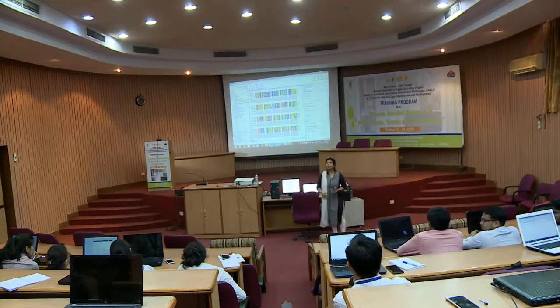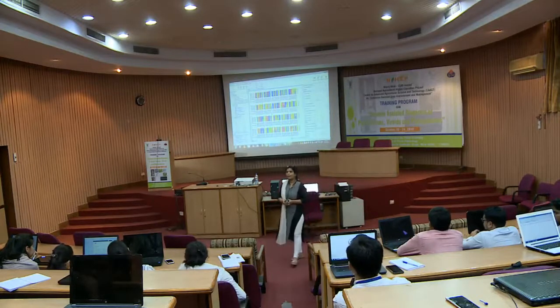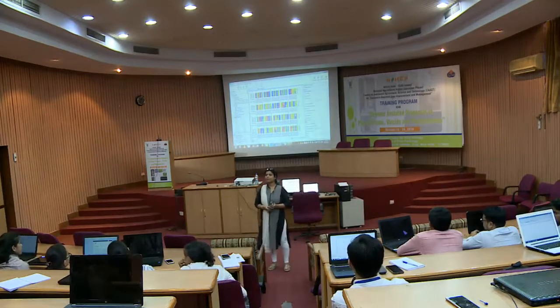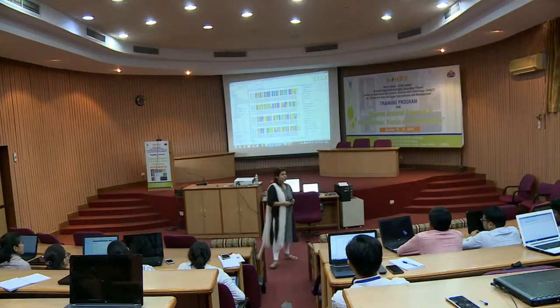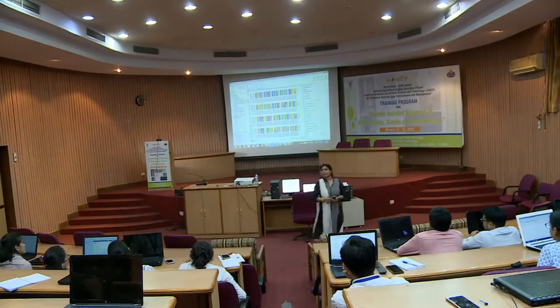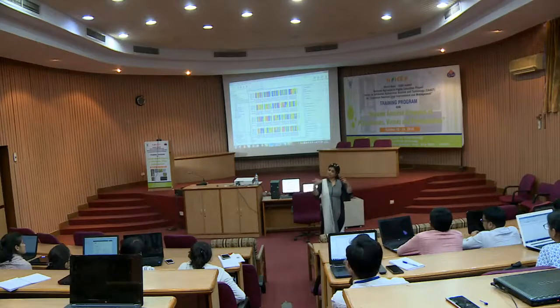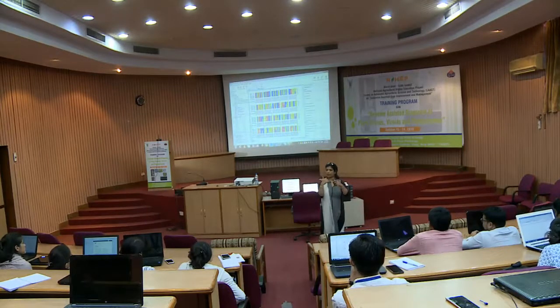Yeah. Right. Actually, I have done over that consensus sequence. Means it is similar or not? Consensus is, yeah, what is Contig? Consensus is actually similar, right? Contig is that you are joining the regions considering the overlapping region. Consensus is similar among all.